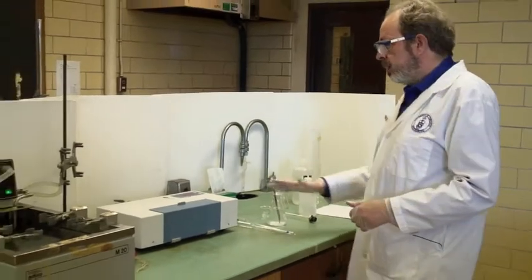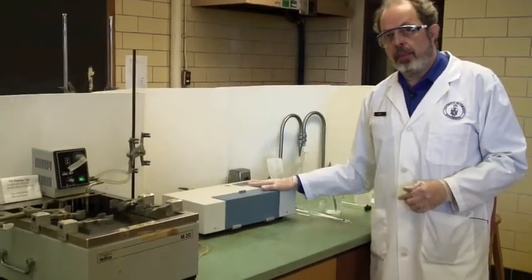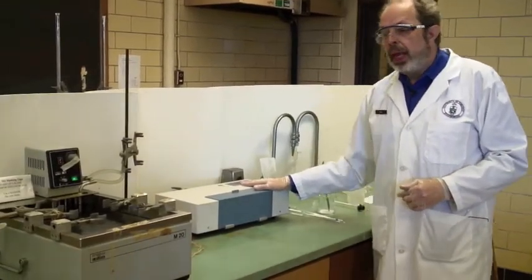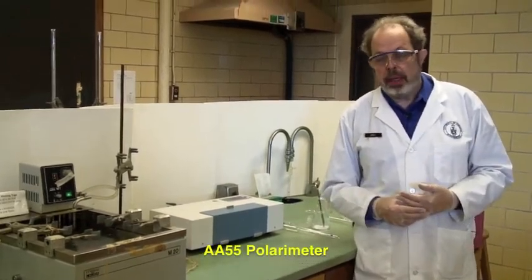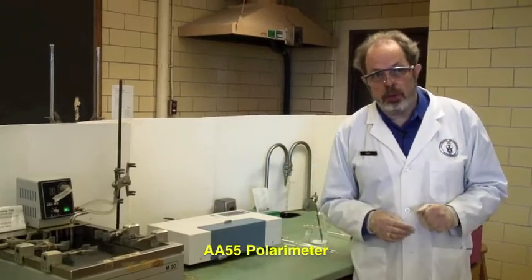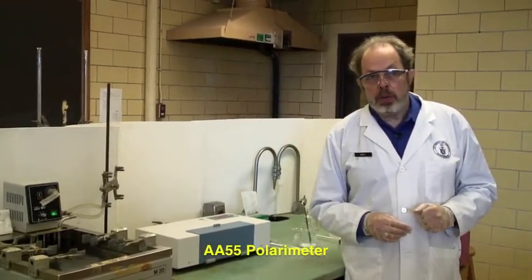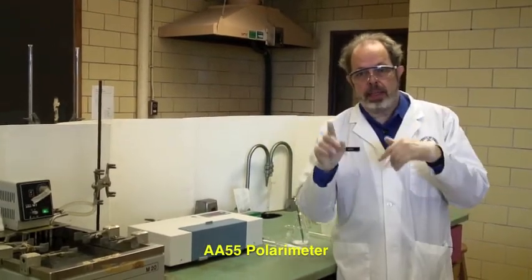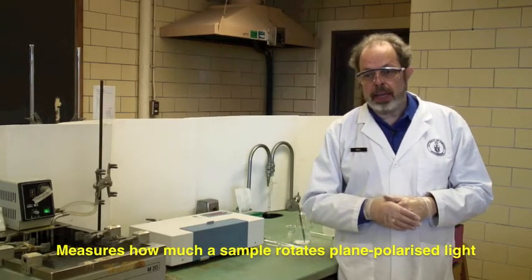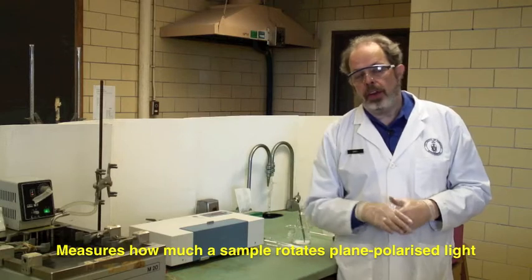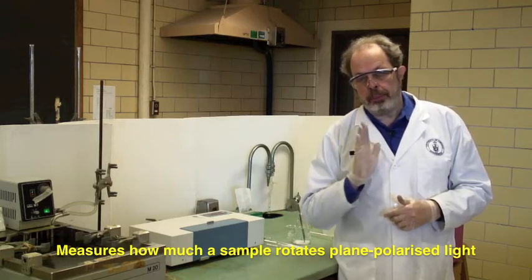This is an AA55 polarimeter. It measures the rotation of plane polarized light. It operates on the same principle as polaroid sunglasses. Most light is scattered, that is it is in all different directions. Plane polarized light has the waves of the light all moving in one plane.